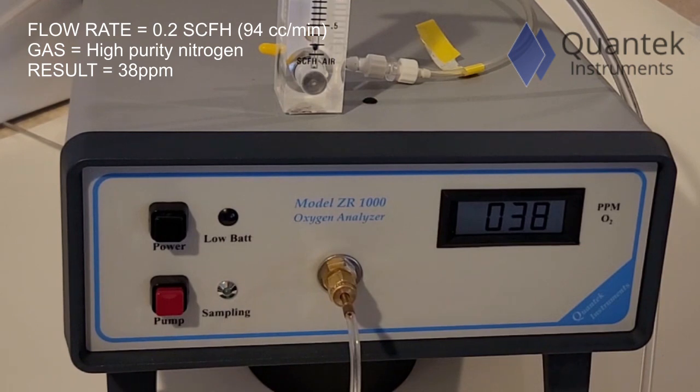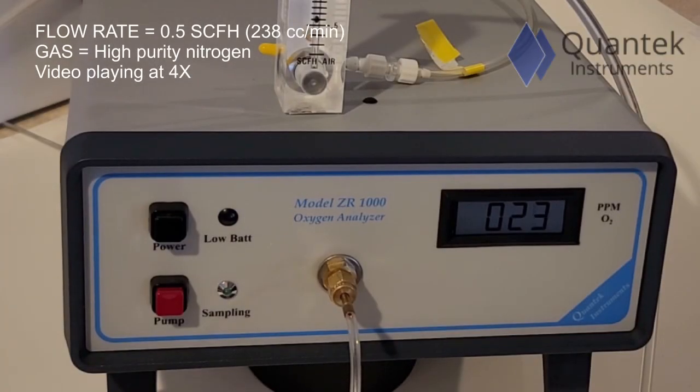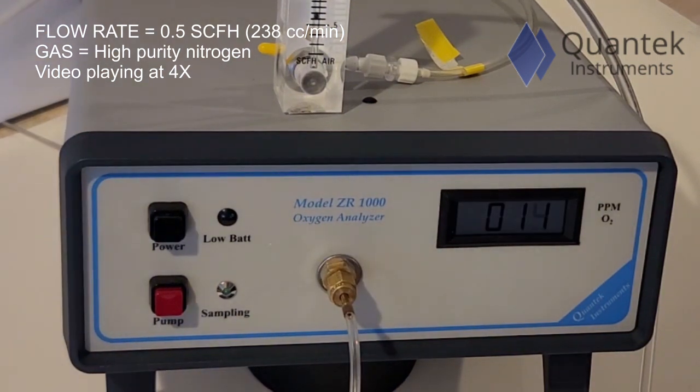Next, we'll increase the flow rate from 94 cc's per minute up to 238 cc's per minute. As you can see, the high-purity nitrogen only reaches 11 ppm.